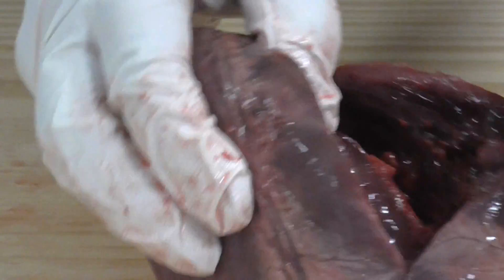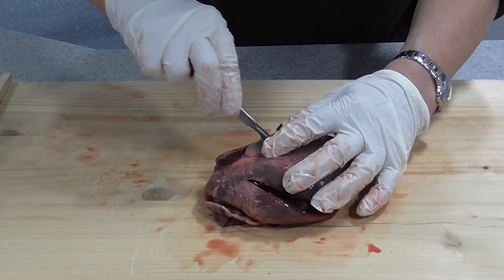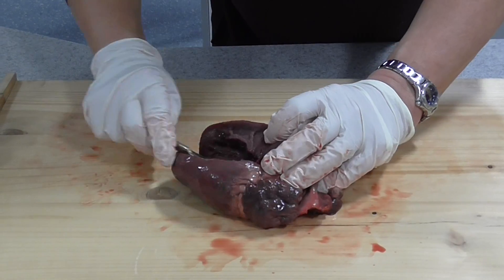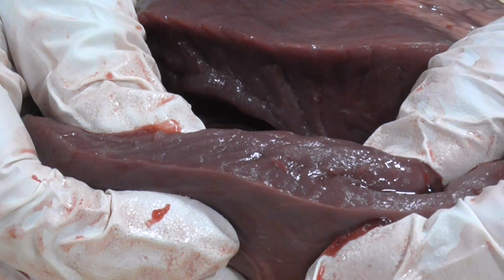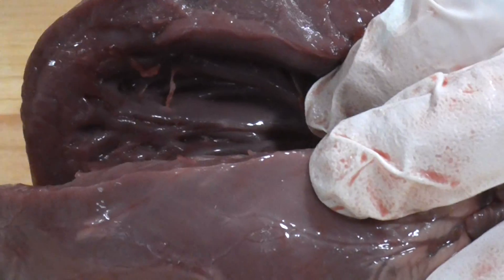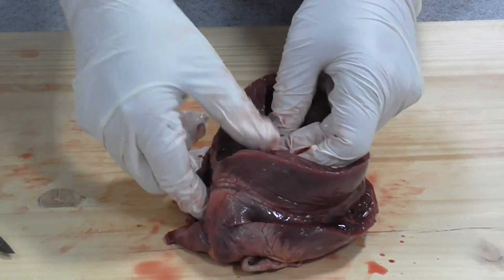Now I'm going to do the same on the left side, cutting down the wall of the left ventricle. The left ventricle has the job of pumping blood via the aorta all the way around your body, so it has to contract with a great amount of force to create a really high blood pressure. Looking at the wall of the left ventricle, it's more than a centimetre - possibly 1.5 centimetres thick in places - of cardiac muscle. The left ventricle wall is much thicker because it has to contract with greater force to create a much higher blood pressure to push blood all the way around the systemic circulatory system.